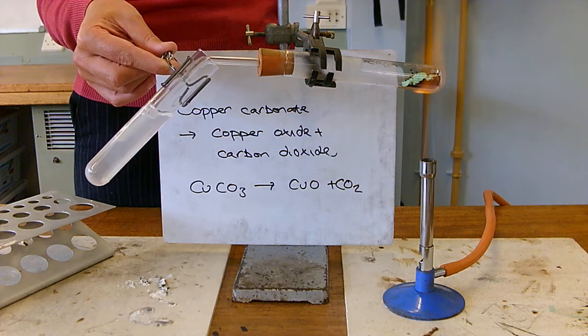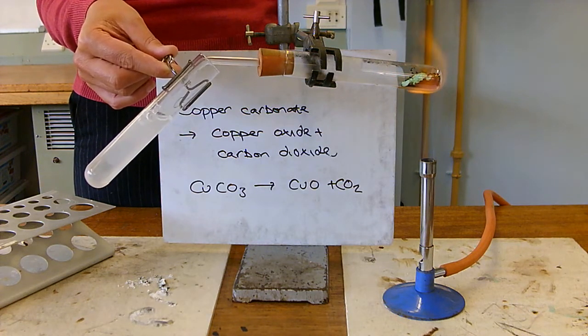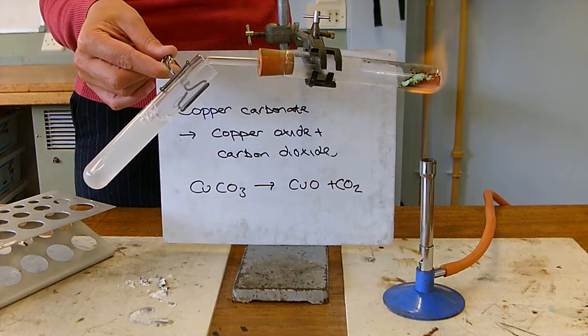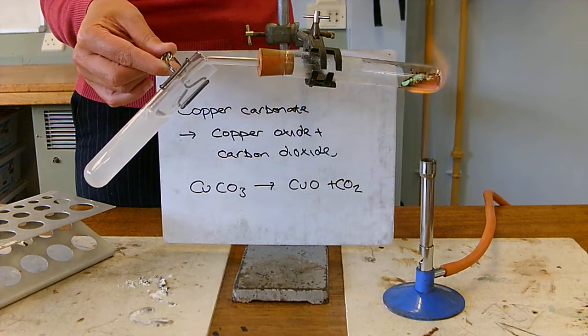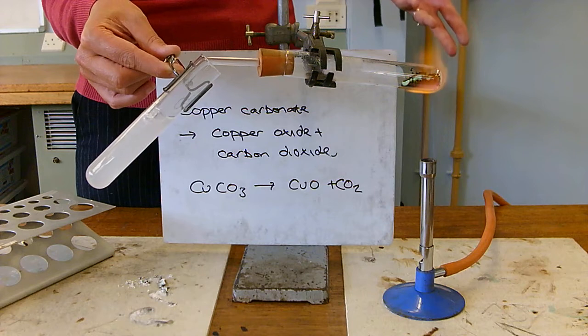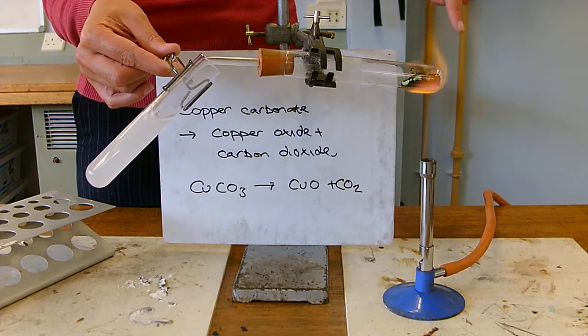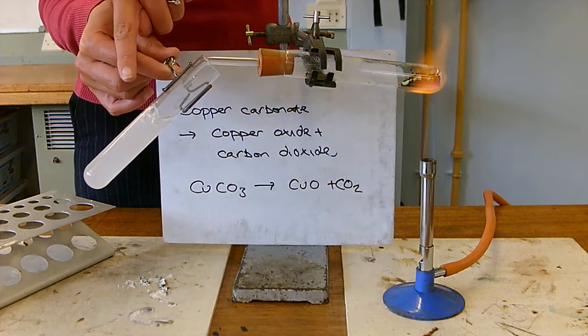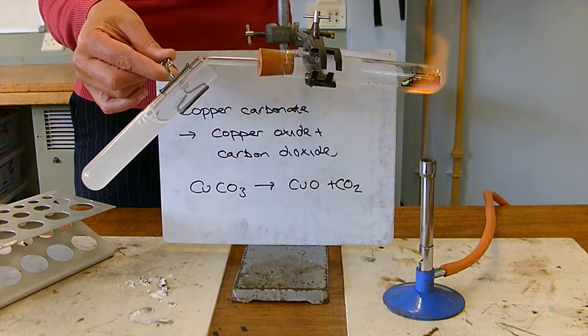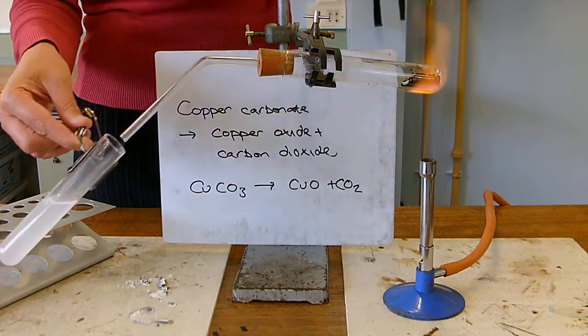The lime water slowly, as those bubbles of carbon dioxide go through it, is getting cloudier and cloudier. So, the heat has taken the copper carbonate and split it apart, broken it into two pieces. Copper oxide, the black stuff at this end. And carbon dioxide, the gas at this end, has made our lime water really cloudy.